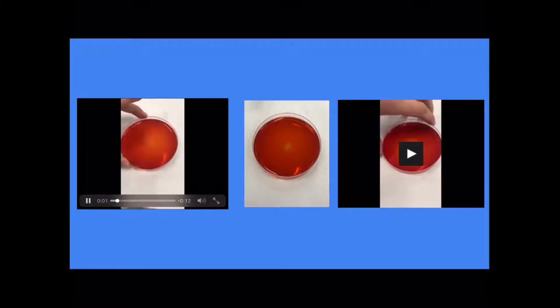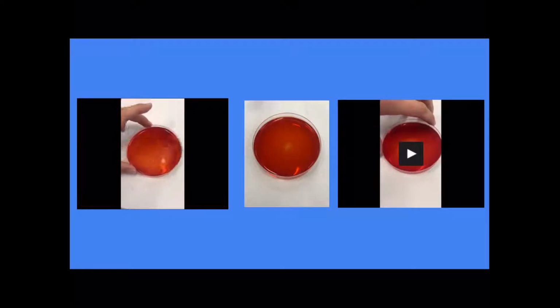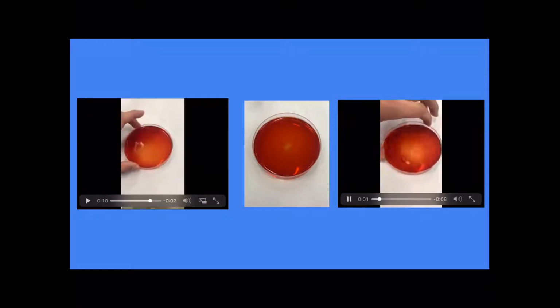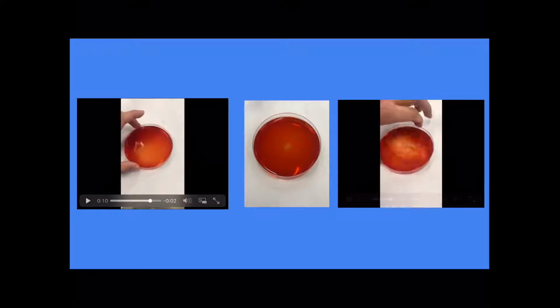In this video, the potassium nitrate is swirled to yield the same dark red transparent solution, and in the middle, a little bit of sodium phosphate is added, which then when mixed goes back to equilibrium in a clear solution.